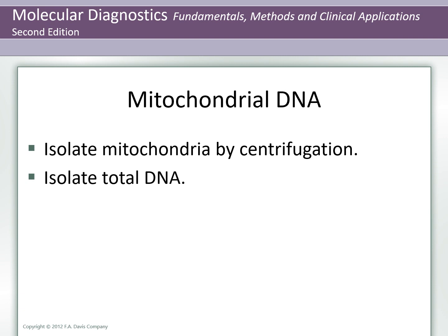The mitochondria can be lysed with detergents and the lysate treated with proteinase to remove protein contaminants. Mitochondrial DNA can be precipitated with cold ethanol and resuspended in water or appropriate buffers for analysis. The second approach to mitochondrial DNA preparation is to isolate total DNA. The procedure is similar to that described in the centrifugation method. The preparation will then contain mitochondrial DNA that can be analyzed within the total DNA background by hybridization or by PCR.